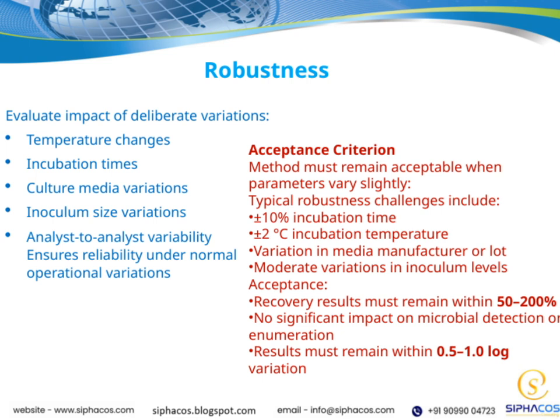It's about ensuring our method remains reliable during normal operational variations, including variability between analysts. In essence, robustness is about building confidence that our method performs reliably under slightly different conditions, which is crucial for maintaining quality and consistency in our microbial testing processes.